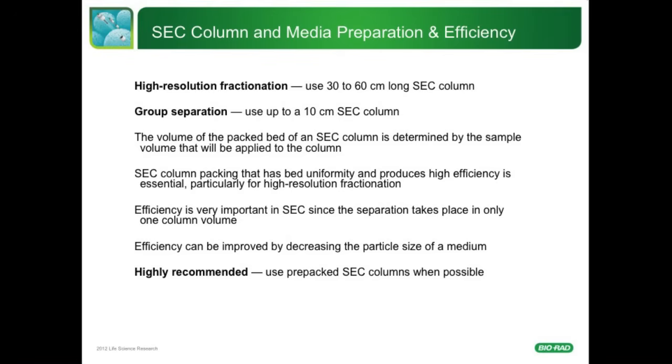Efficiency is very important in SEC since the separation takes place in only one column volume. Efficiency can be improved by decreasing the particle size of a medium. It's highly recommended to use prepacked SEC columns when possible.